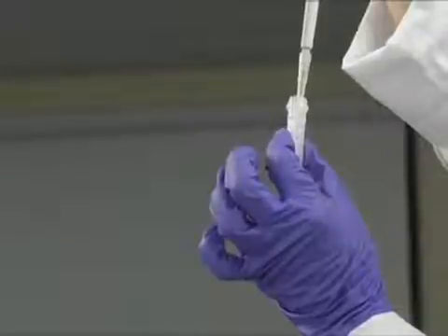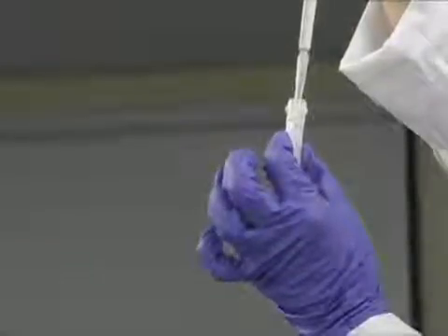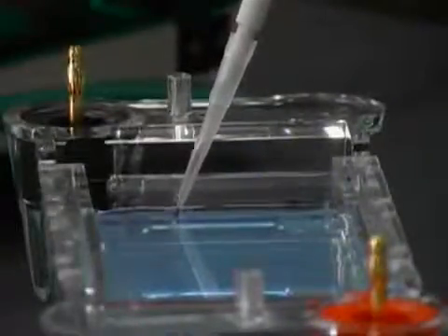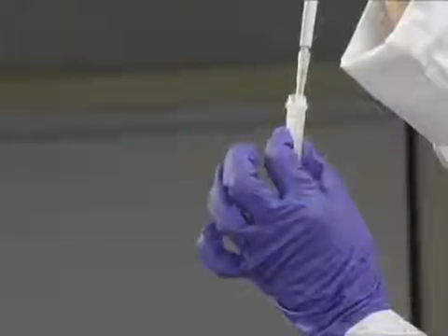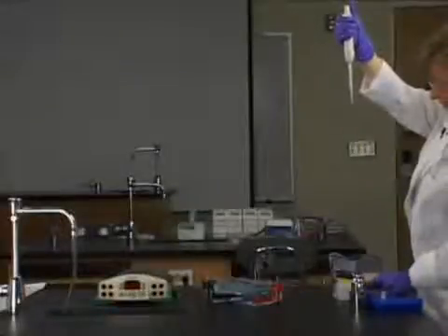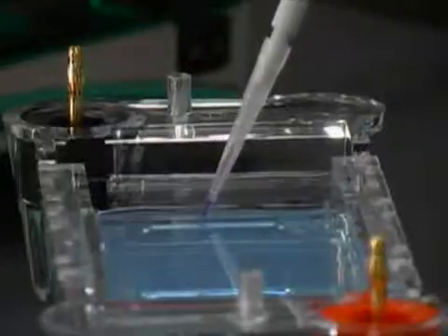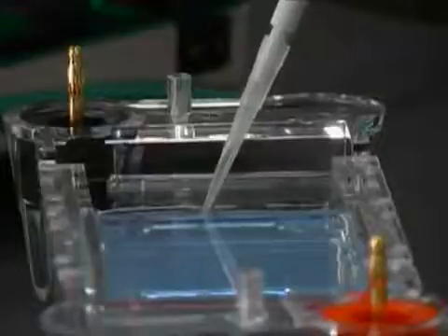This third vial was digested with PstI and a second restriction endonuclease. So we're going to have DNA of different sizes. This has been digested with 3 restriction enzymes. So we'll have multiple bands appear in this well. Down into the well, and voila.